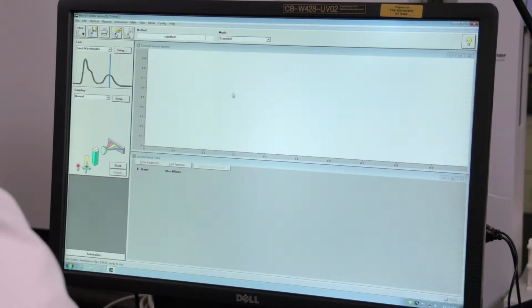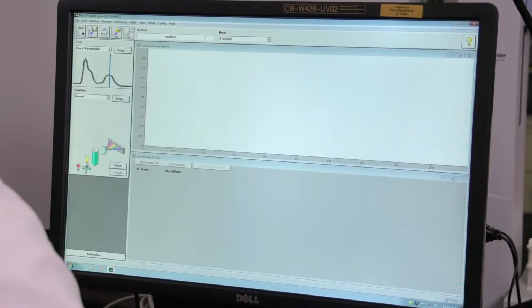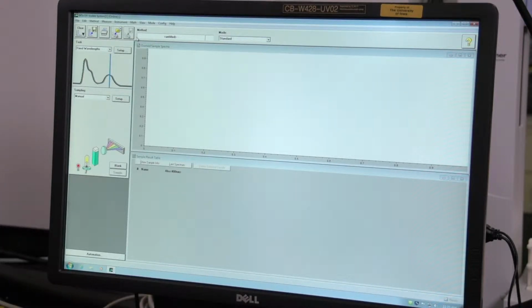When it's loaded, go to Instrument and then click on Lamps, and make sure that both the deuterium lamp and the tungsten lamp are turned on, and click OK. You'll want to wait at least 8 minutes before you take a sample spectrum to let the lamps warm up.